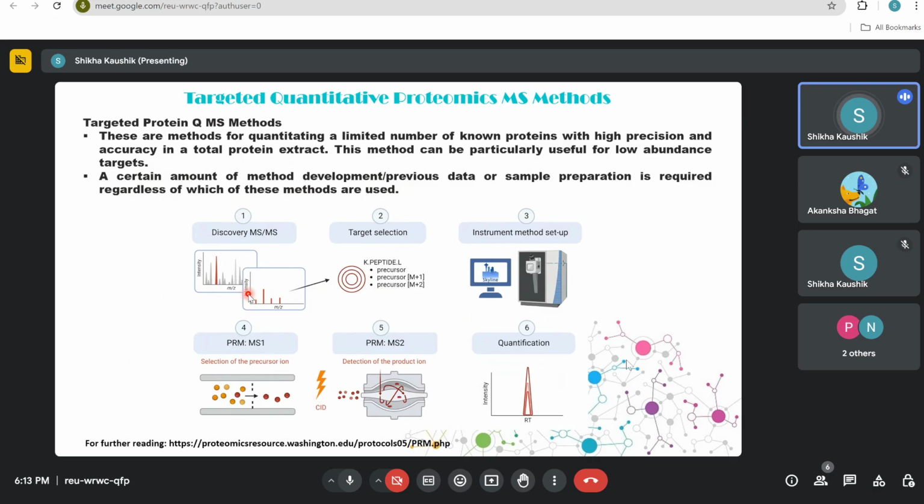And then, once you are aware that these proteins are present, you take your sample and move to high throughput mass spectroscopy, where you're going to do your targeted quantitative proteomics, either using a quadrupole system or any other hybrid technology you can also use. Depending upon whether you want to do a target study, relative quantification, or absolute quantification, you make your workflow. We have talked about workflow in our previous class, so I'm not going into detail.